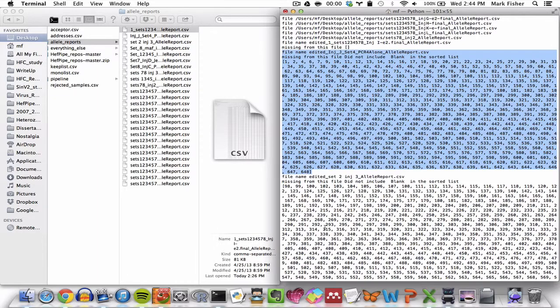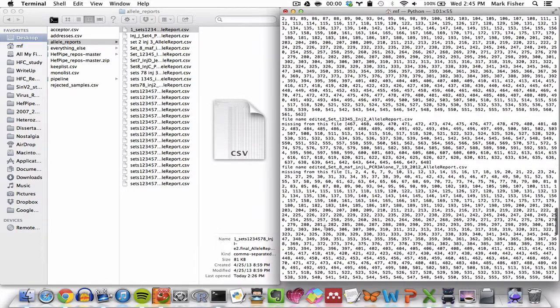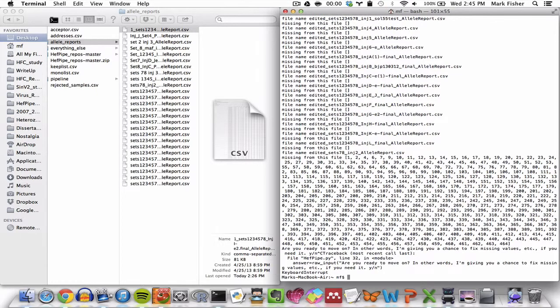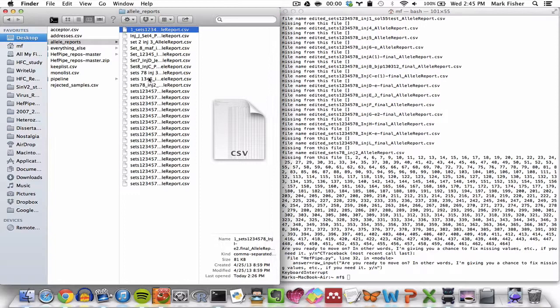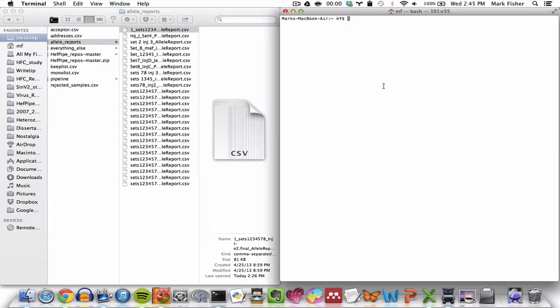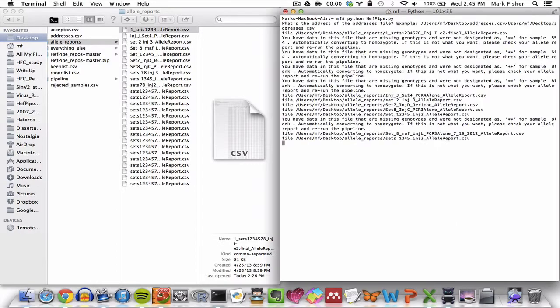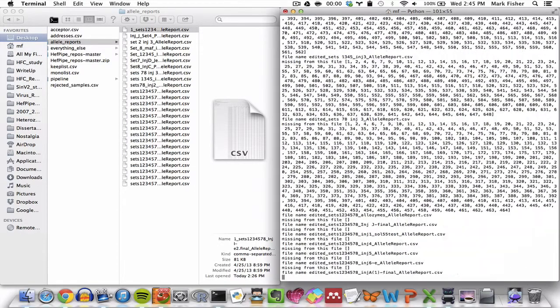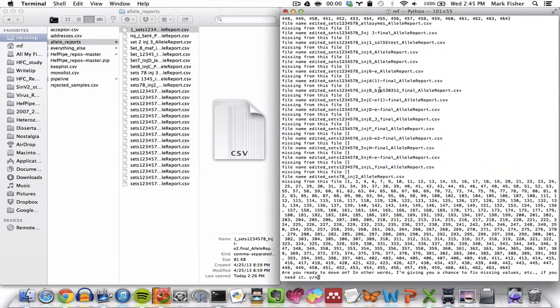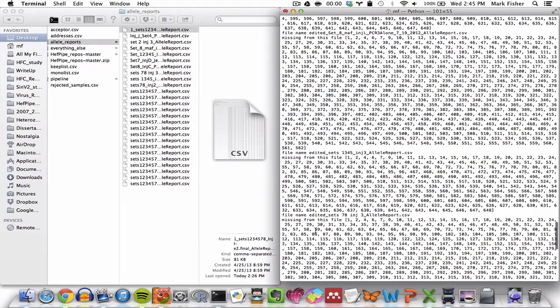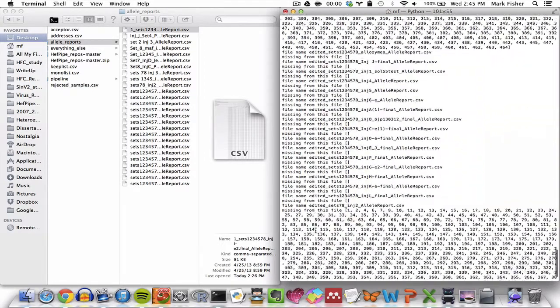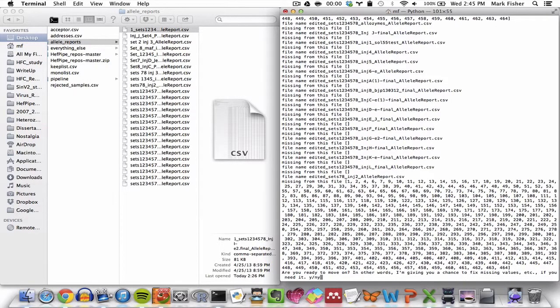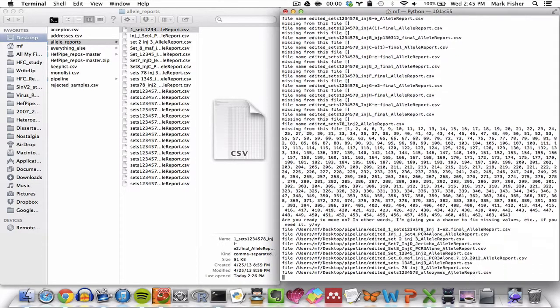So let's say something is wrong. How do I abort the pipeline? Good question. I just press control C and the pipeline aborts. And if I went back and adjusted something in these original allele reports, I could then rerun the pipeline again. And this time let's assume that these missing data are acceptable and things I expect. In this case I would just type Y and then hit return.